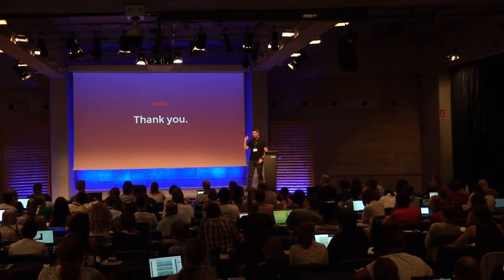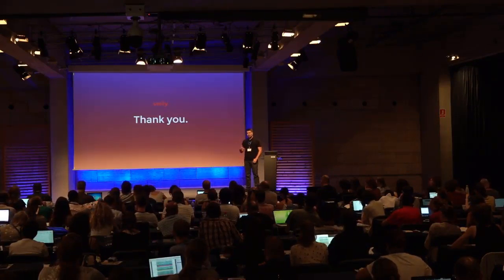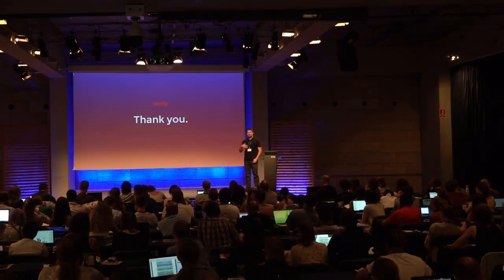That's a good question. In this work, we haven't predicted retention times yet. We are working on a model that's going to do that. But in principle, they could be included in the same model. We don't even need a separate model. We could just include the retention times as another type of output that the model predicts. Retention times are not that difficult to predict. We have tried that with simplistic approaches. It can work very well, especially for the DIA data set, where a lot of people just include iRT peptides in it, so we get normalized retention time as opposed to seeing all the variances that different columns and different labs would produce. So we can predict standardized retention time quite successfully.